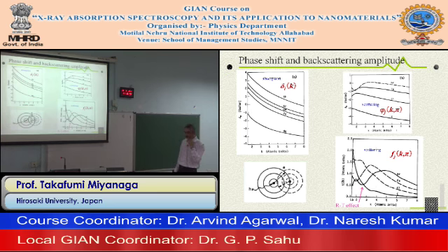Of course, we fit the EXAFS for the candidate atoms using the candidate functions, and we select the best fitting parameters. For example, if we fit with the surrounding atoms as iron, the fitting is not good. But in the case of bromine, the fitting is best. So we can distinguish that the surrounding atom is bromine.